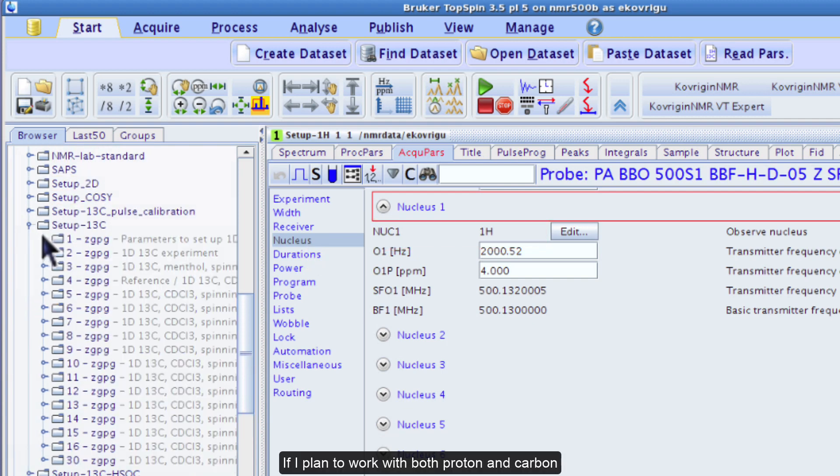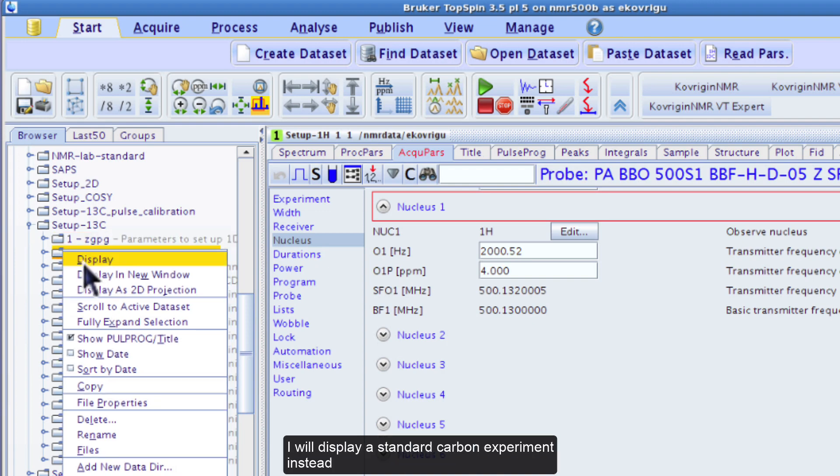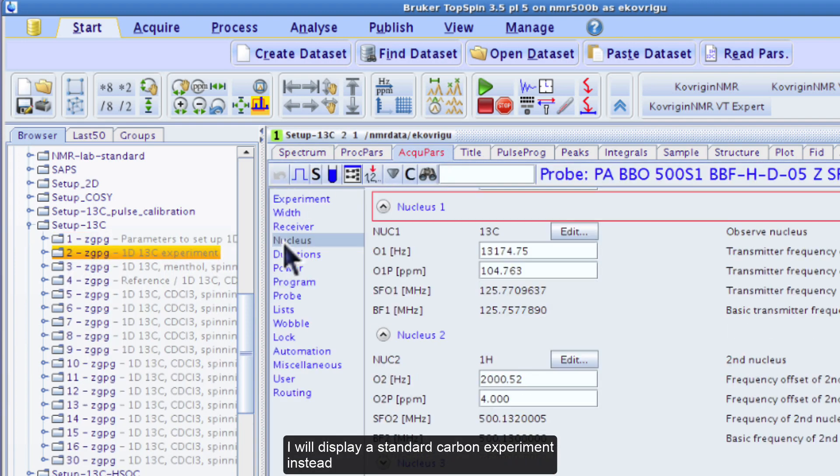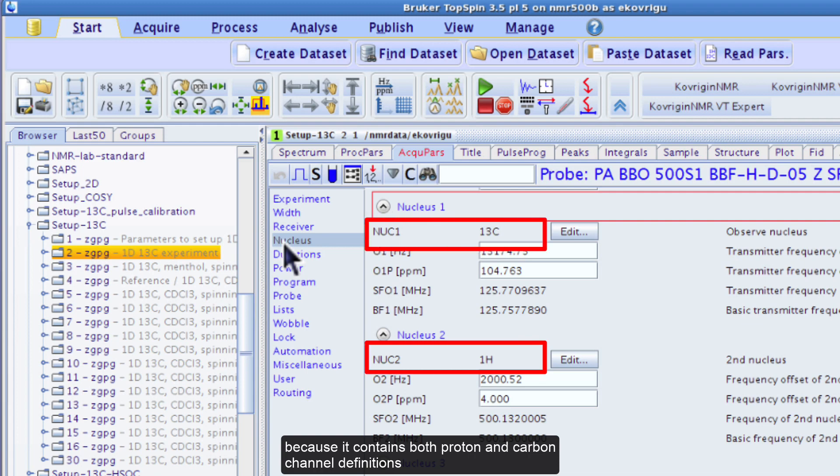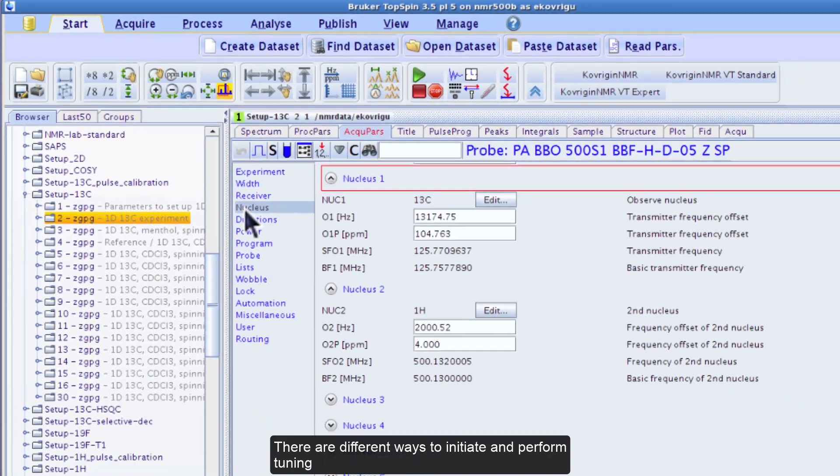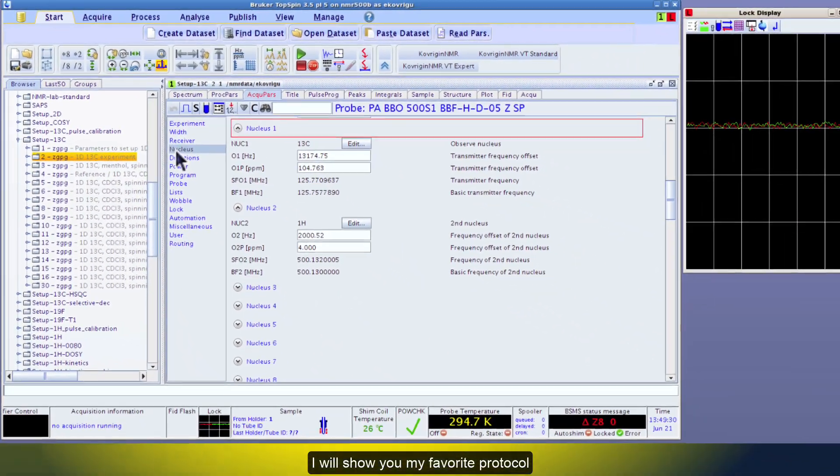If I plan to work with both proton and carbon, I will display a standard carbon experiment instead, because it contains the proton and carbon channel definitions. There are different ways to initiate and perform tuning. I will show you my favorite protocol.